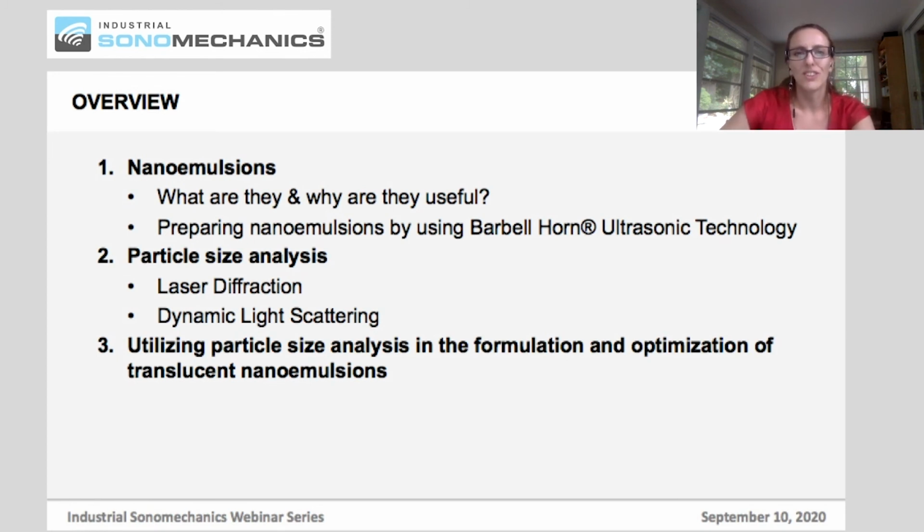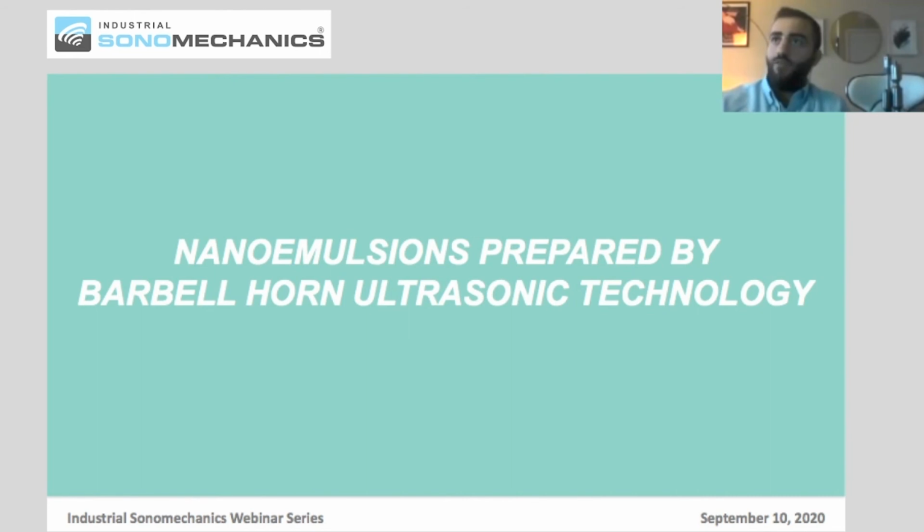Thank you, Eva, for that introduction. So to begin this webinar, I want to start briefly with a discussion on nanoemulsions and how we formulate them and how we prepare them with BARBELL horn ultrasonic technology. So, nanoemulsions.